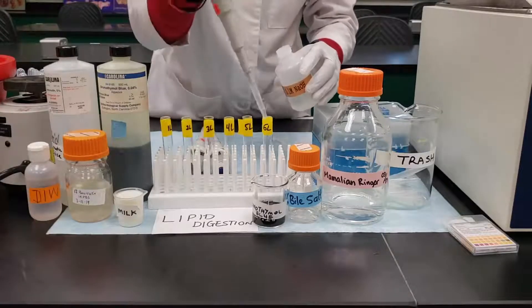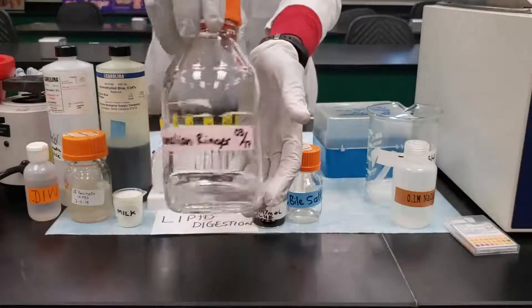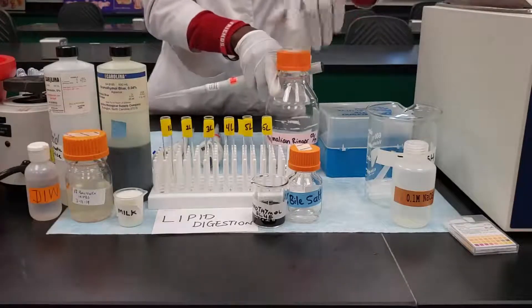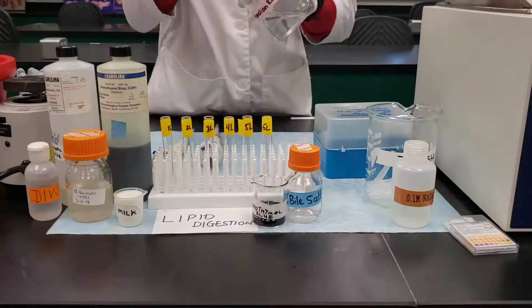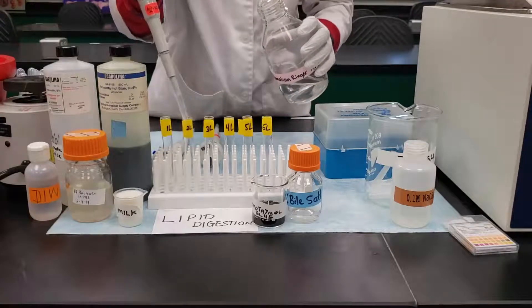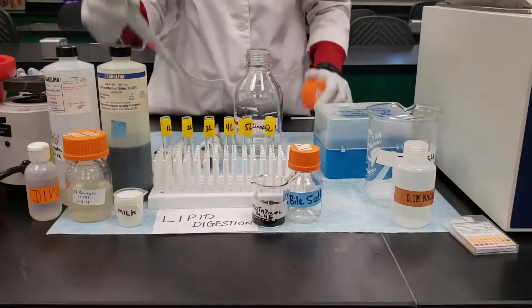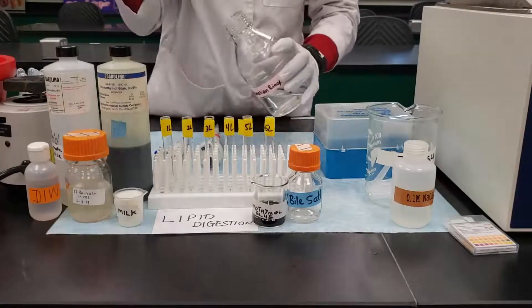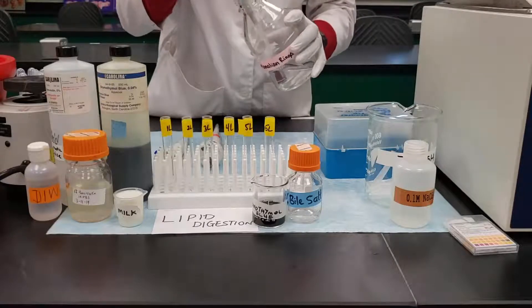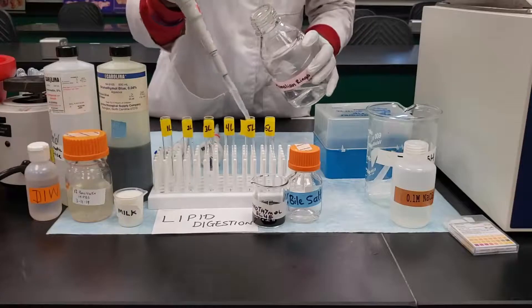Immediately after adding the sodium hydroxide, the next thing to do is take the mammalian ringer solution. Add 1 mL to tubes 1, 2, and 6. Then add 2 mL of the mammalian ringer solution to tubes 3 and 5. You can do the 1 mL twice since we have the 1 mL volume available, to make it 2 mL total.